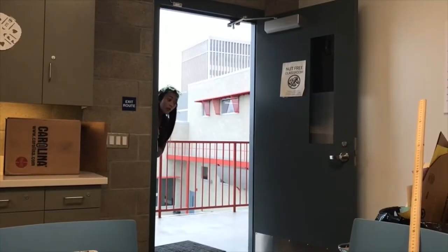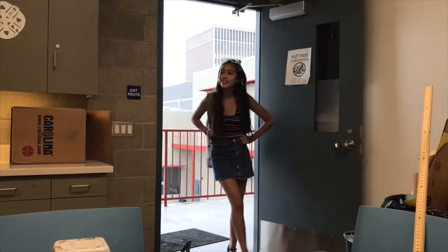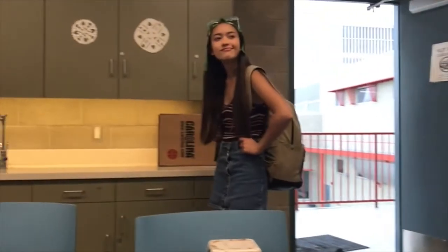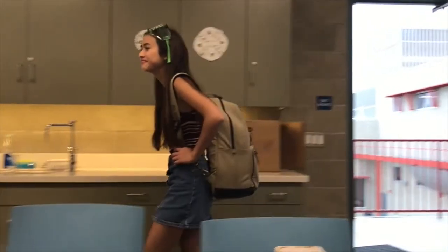At this point, you may be wondering, what mistakes is Taylor referring to? Well, let's start at the beginning. Notice that, as she's walking into the lab, Taylor is wearing a miniskirt and open-toed heels. This is not appropriate lab attire. On lab days, you should be wearing closed-toed shoes, preferably flats unless you're a full-time stiletto wearer, and long pants. You should also, unlike Taylor, have your hair tied back.